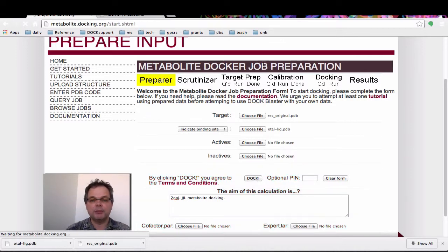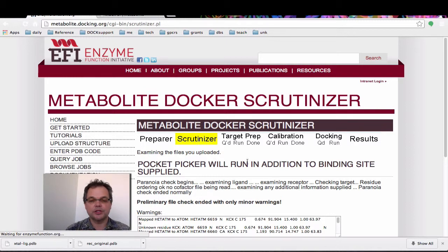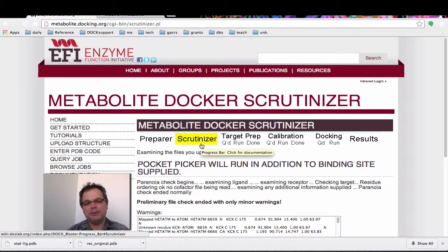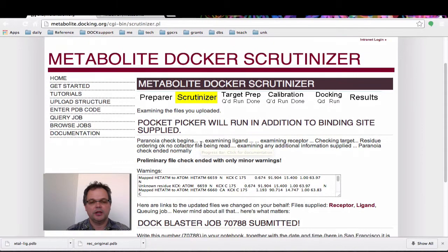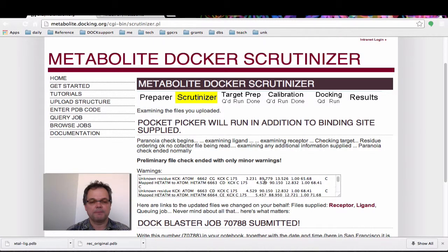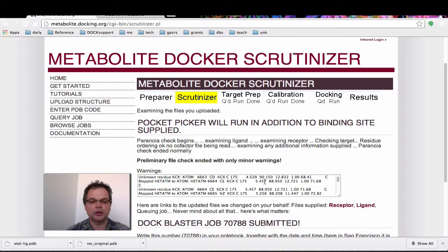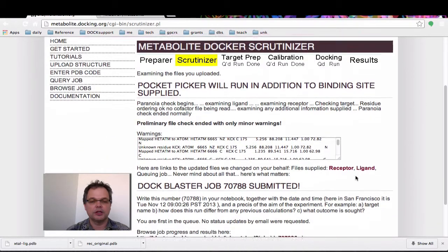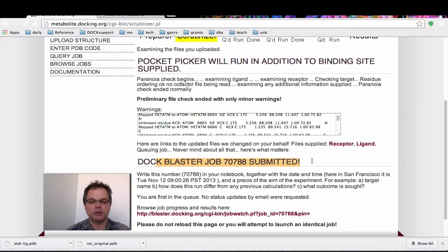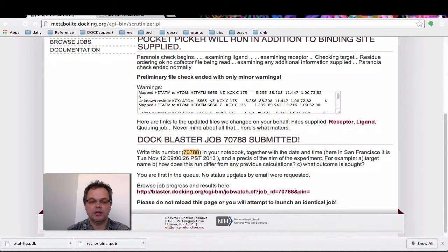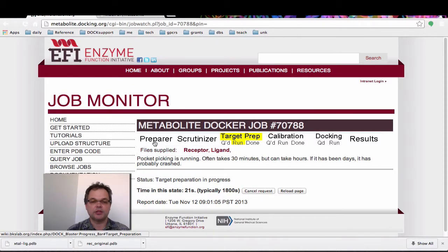This is the job preparation step. It's now going to look at the results we've uploaded — the scrutinizer. PDB files are complicated things, so it's going to do some sanity checks on the file. It's generated a few warnings that I should probably go and look at. It seems to have run the job for us, and the DockBlaster job has been submitted. The job number is 70788. When you click on Browse Progress Report, it shows we've gone from the preparer to the scrutinizer to target preparation, which is now actually running.